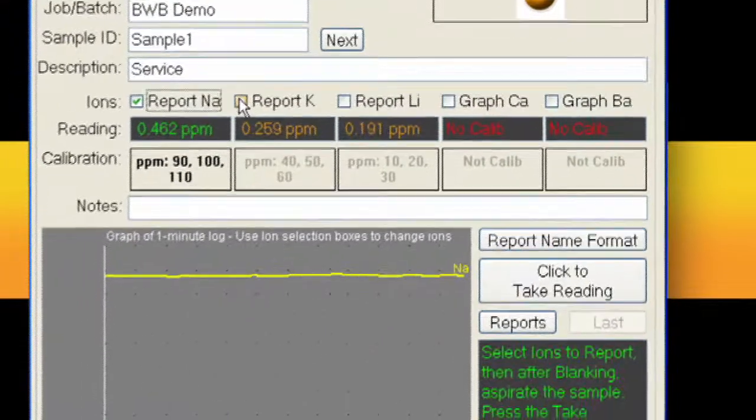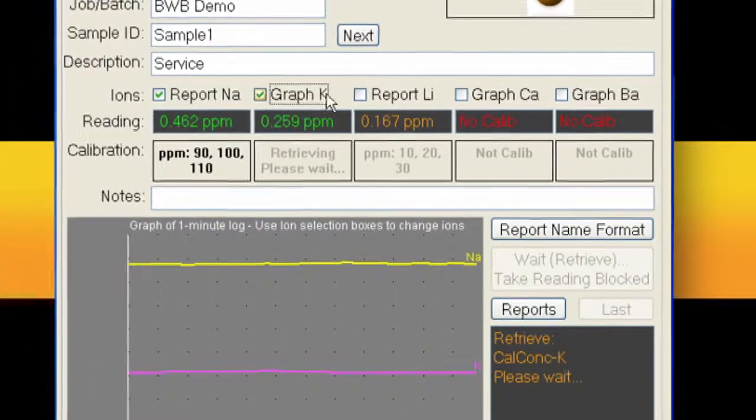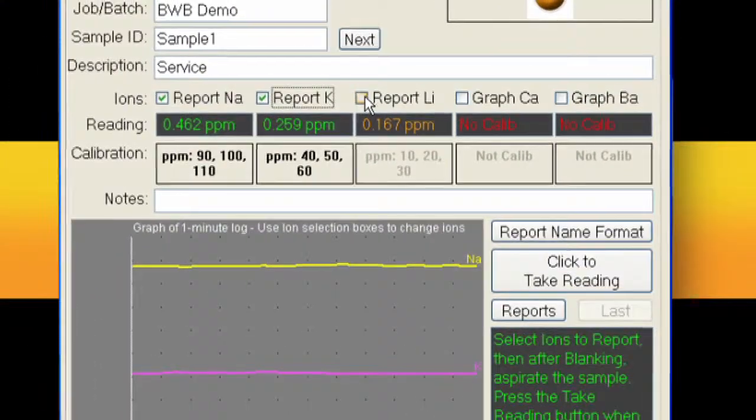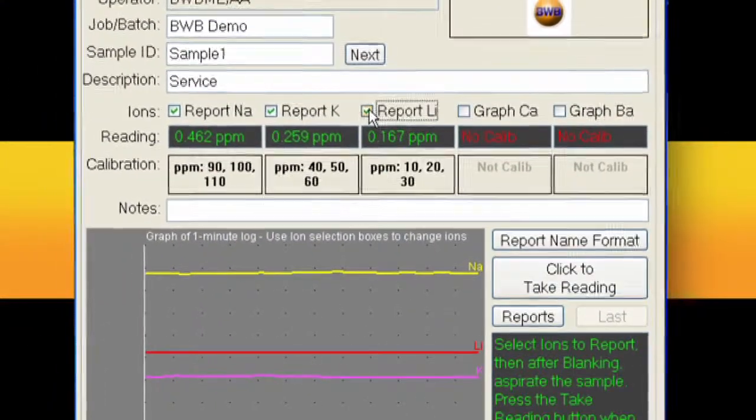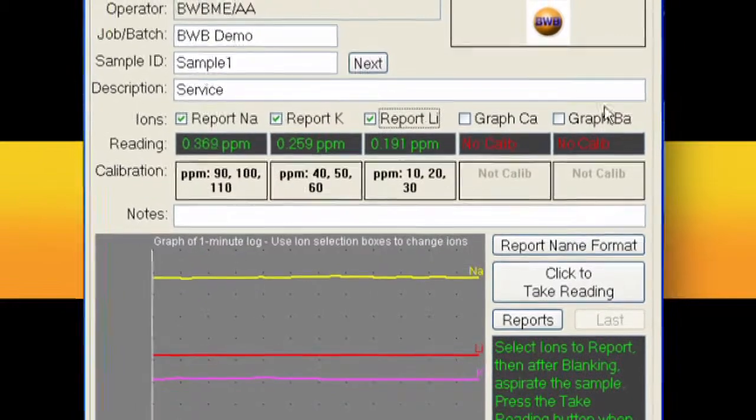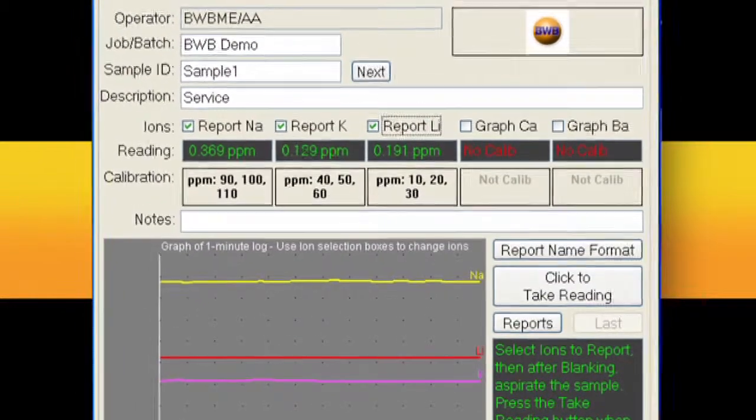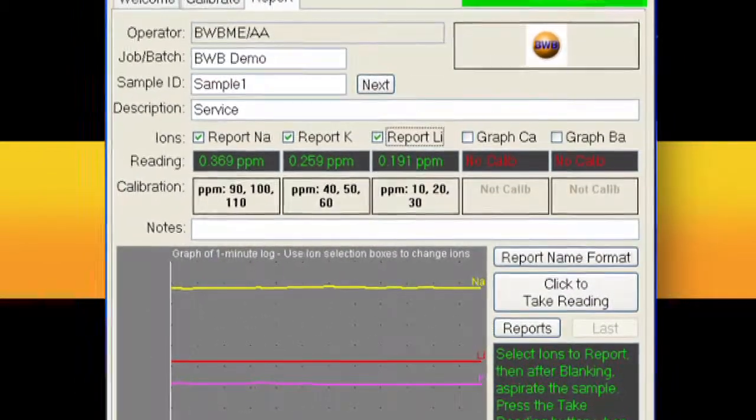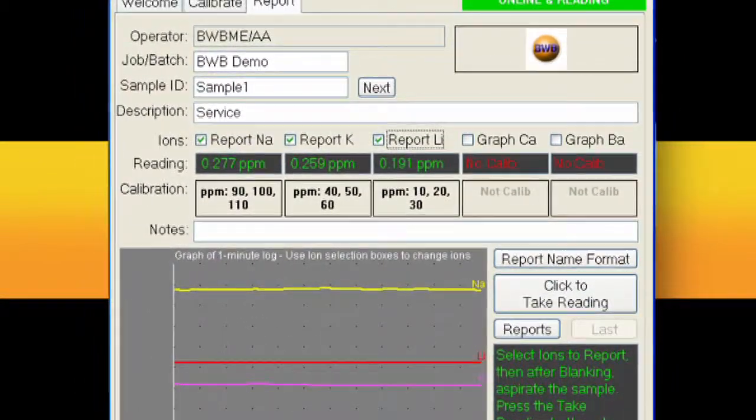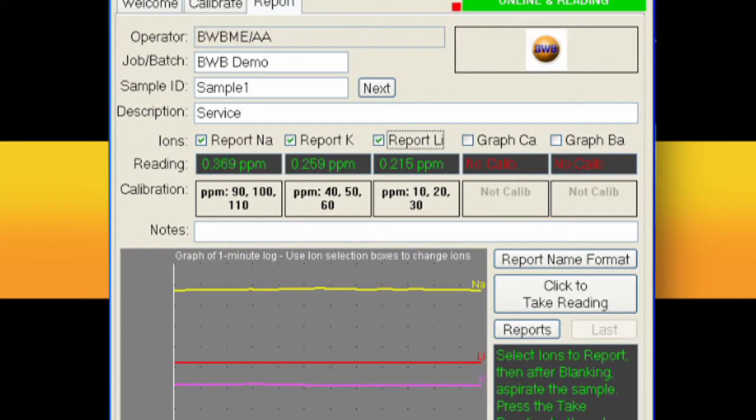Tick the ION box to watch it on the one minute graph. Any or all of the IONs can be graphed as long as they are calibrated. The one minute graph is continually updated so you can monitor the instrument and see when stability is achieved.